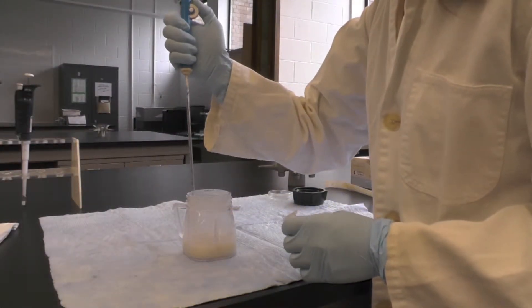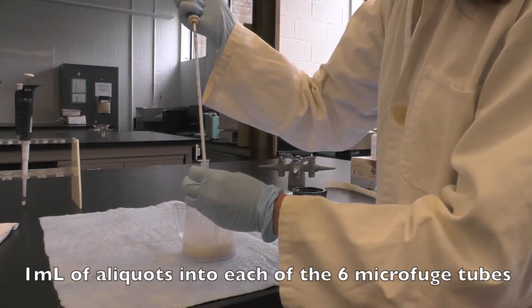Using a disposable transfer pipette, transfer 1 mL aliquots into 6 microfuge tubes.